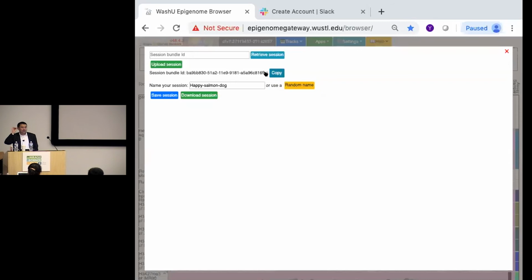But you're going to share this session ID because this is public, right? We don't want people to be able to guess that session ID. So only you will hold on to that session ID and then share with whoever you trust. We do not have the bandwidth to do the security thing, right? So right now, this is the session ID.